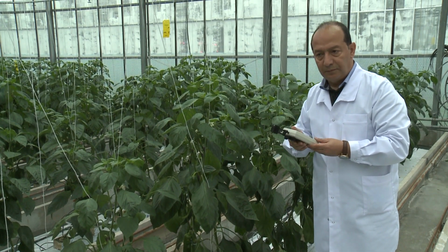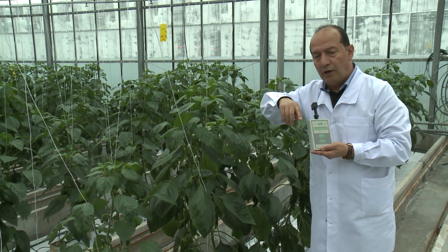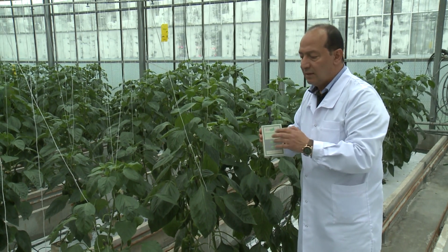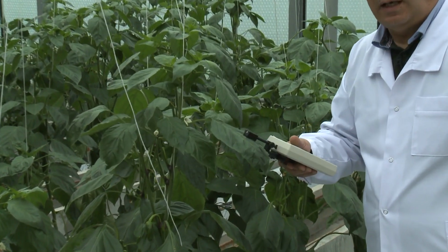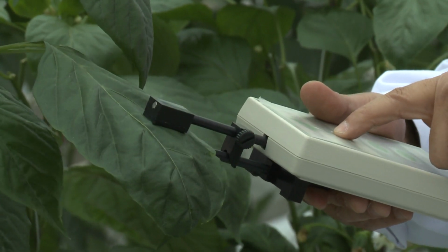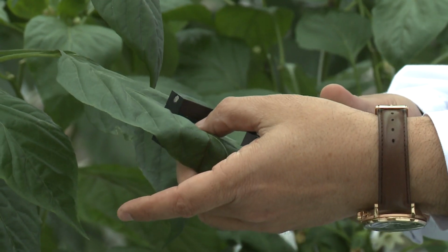Usually it's a very simple measurement, and by the way, it could be calibrated with the chemical methods by a curve which we call a chlorophyll content calibration curve. That means I can take many measurements in a non-invasive way using these instruments. Then after taking the measurement on this leaf, I cut it and take it to chemical analysis to see how many milligrams per gram fresh weight, and then make a calibration curve showing how relative units relate to a certain content of chlorophyll in those classical or SI units.